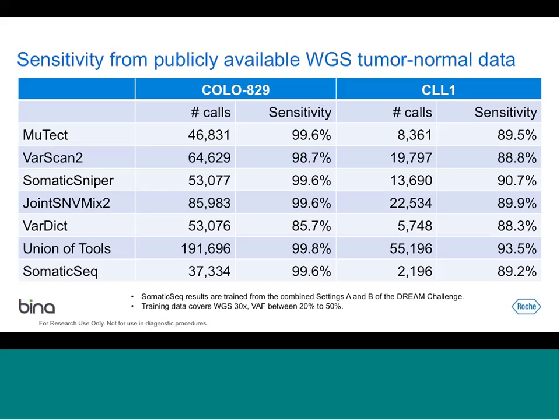And the sensitivity we get here is also maybe a lower estimate because, when researchers do their validation of mutations, they're doing it off a call set, and that call set could be any of the things that we have incorporated. So you're not going to see validated mutations outside that call set.